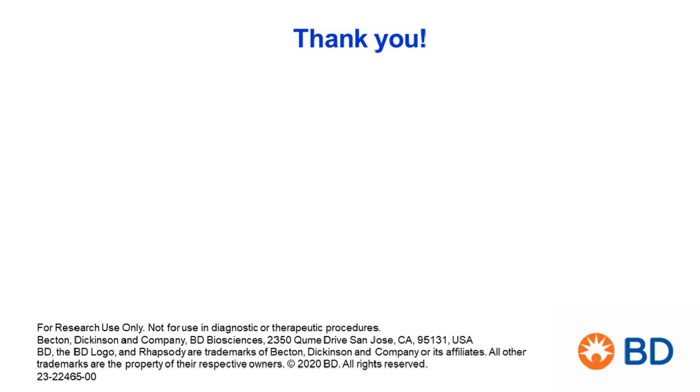Thank you, Dr. Luciani, for that informative presentation. So our first question is concerning what is the effect of cryopreservation on the quality of scRNA-seq and AbSeq data?